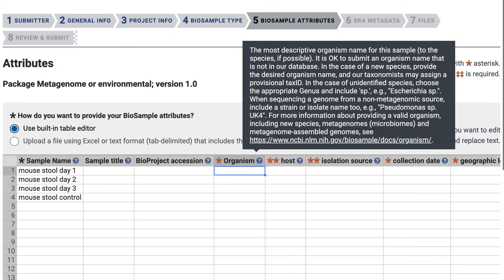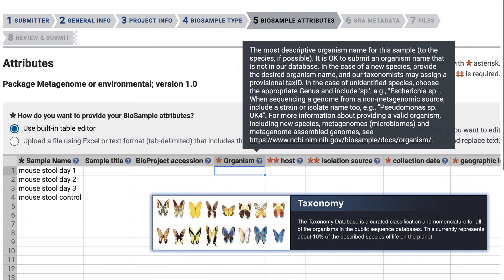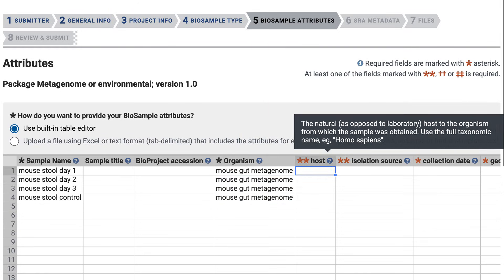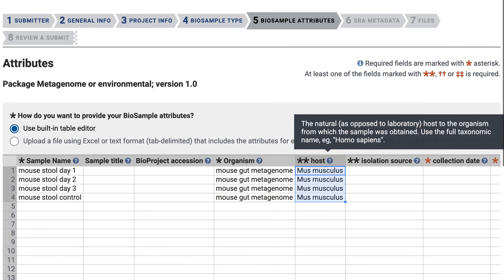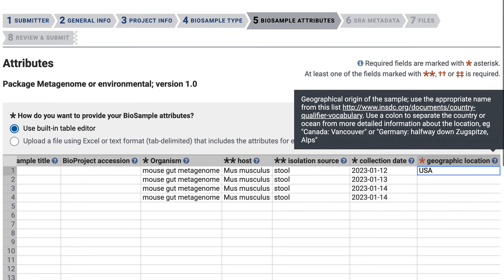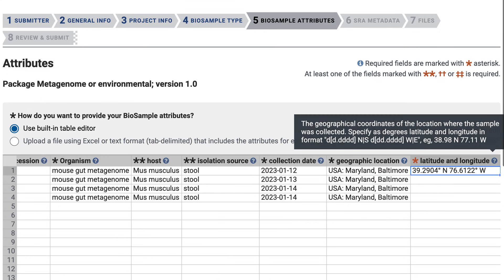Next, enter the organism name. In most cases, you can find the name in the current NCBI taxonomy database. If not, follow the tooltip guide and enter a new name. For metagenome samples, please select one of the existing NCBI metagenome names. I'll enter mouse gut metagenome. For host, use the scientific name, not a common name. In this case, I'll enter Mus musculus. The isolation source is stool. For collection date, you need to add at least the year, but we encourage year, month, and day. For geographic location, add at least the country, but more information is better. I'll add a country, state, and city. Latitude and longitude are especially useful for field samples and providing a more precise location.